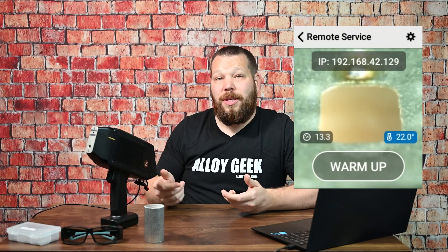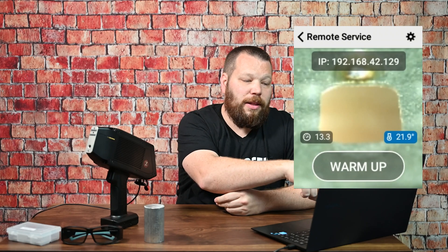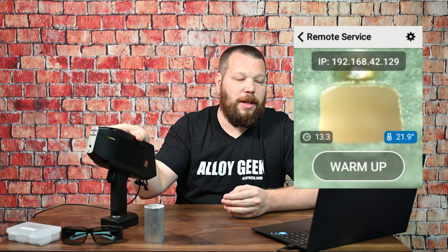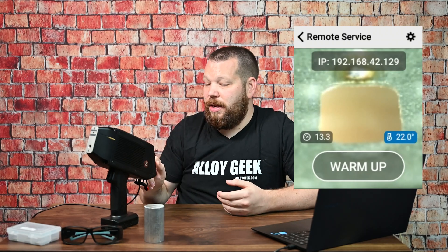We're going to have to warm this unit up before we even begin testing. There are a couple of things on the screen we should talk about. If you have an argon unit like this one, you see that little gray screen with the white text at 13.3 — that's PSI, the pressure of argon being detected by the instrument. If that's red and flashing, you may have an empty argon tank. Also, the temperature of the actual laser diode itself is shown in blue, and that needs to be around 26 degrees Celsius.